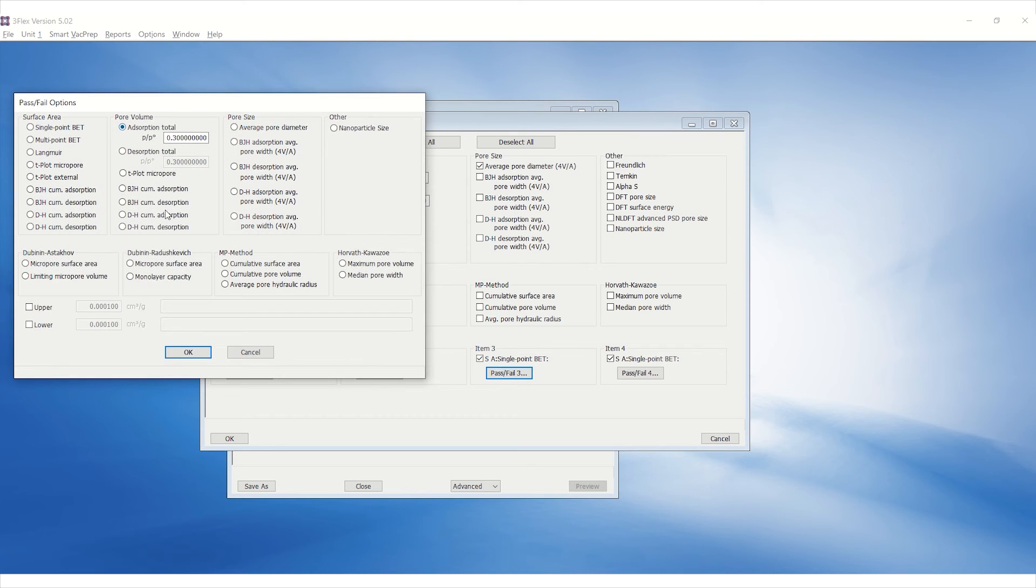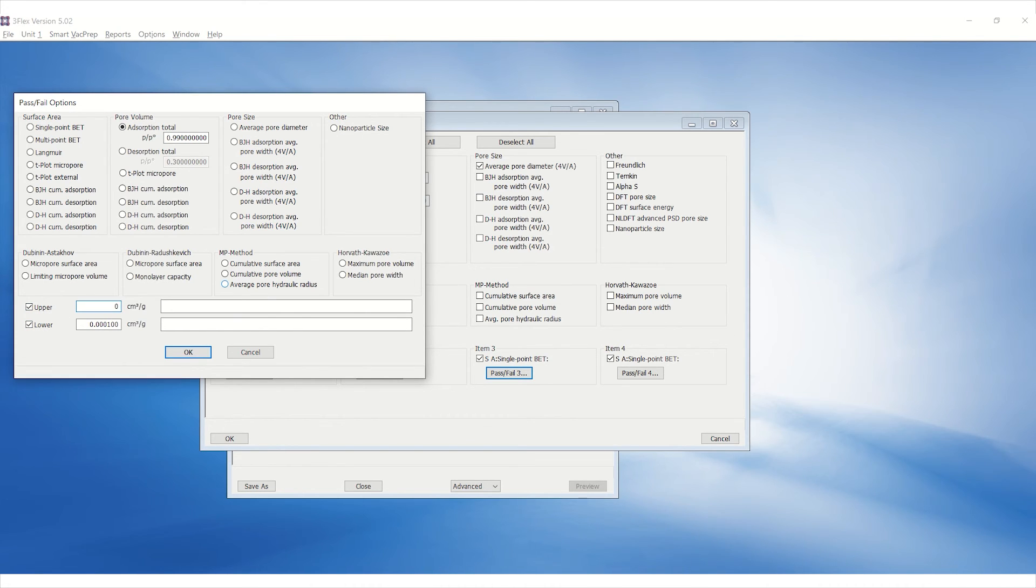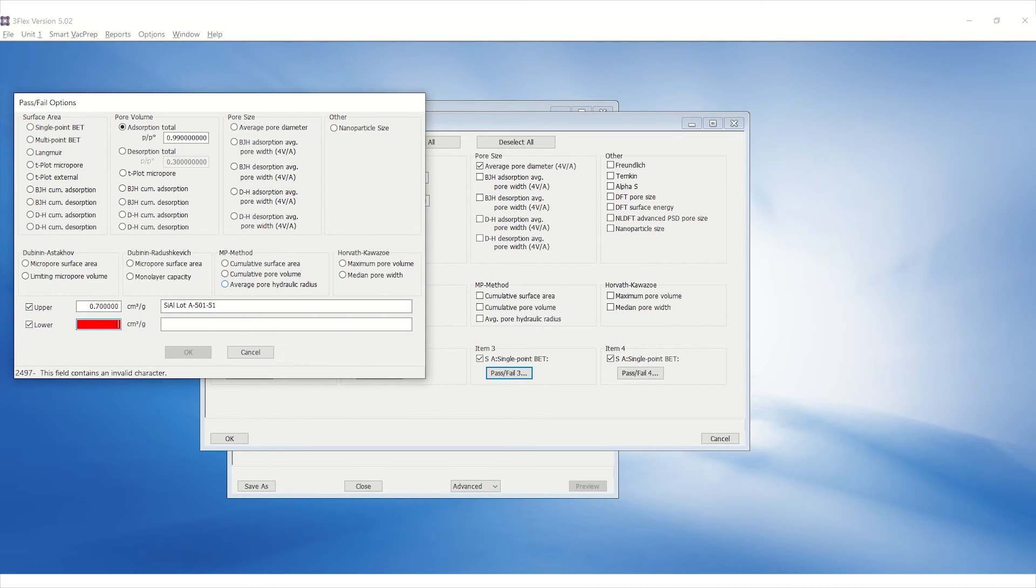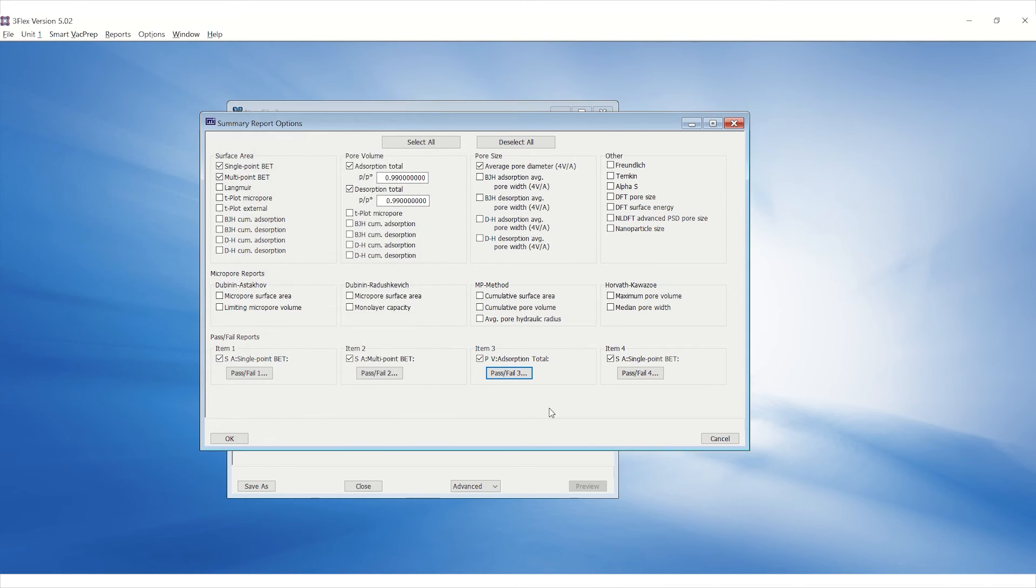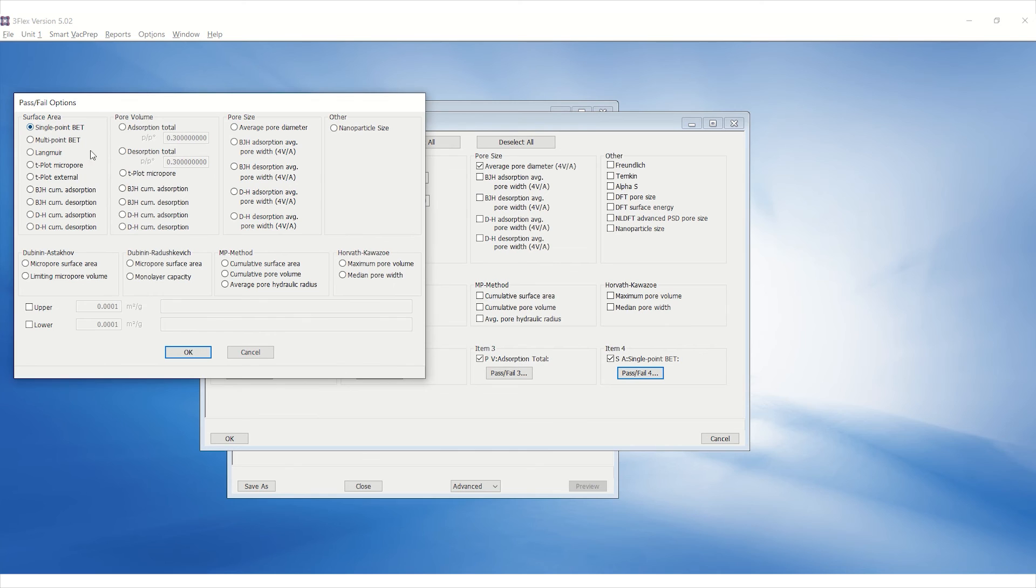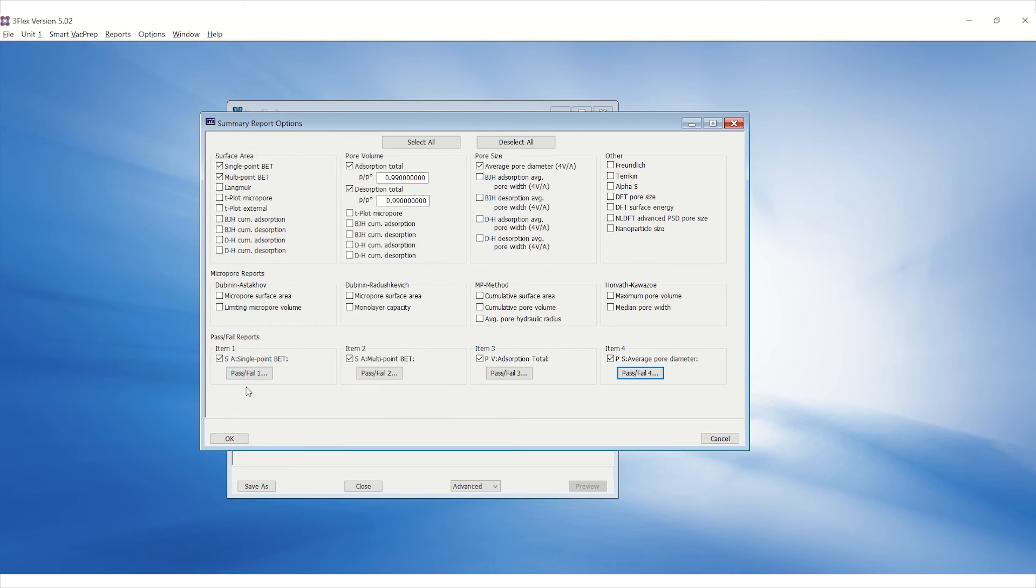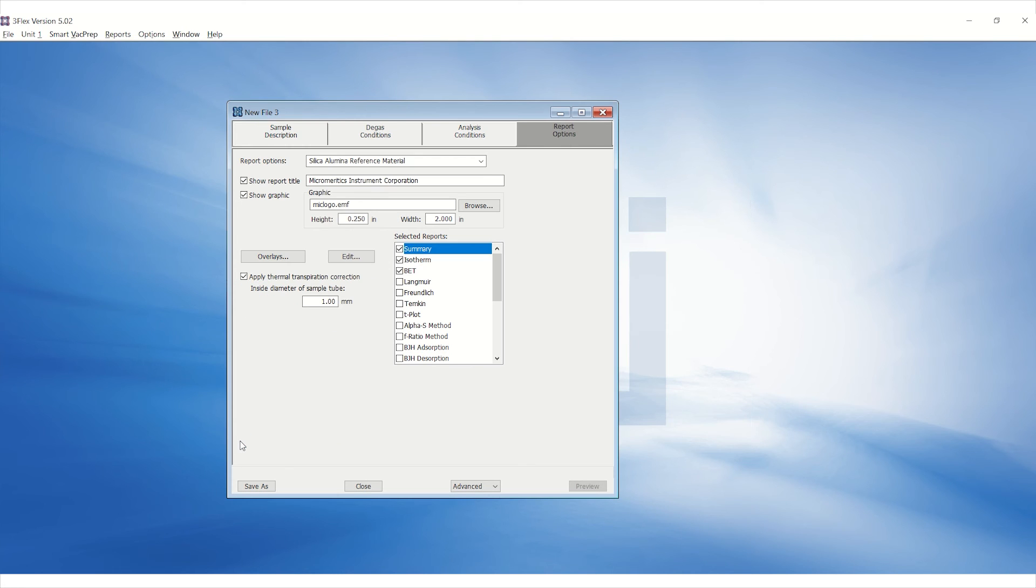Adsorption Total Pore Volume, and Average Pore Diameter. Click OK to save.